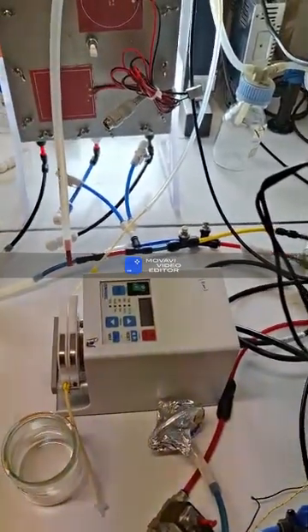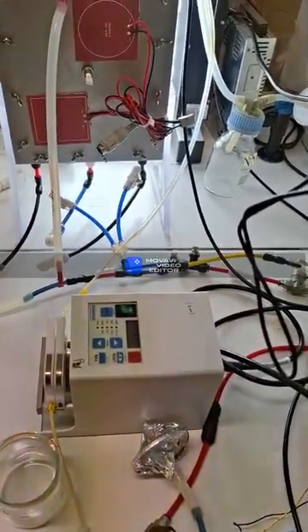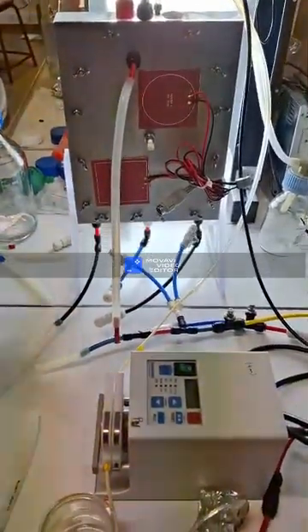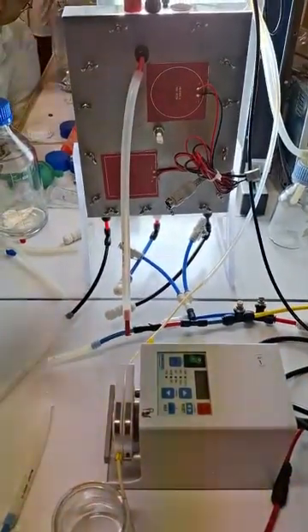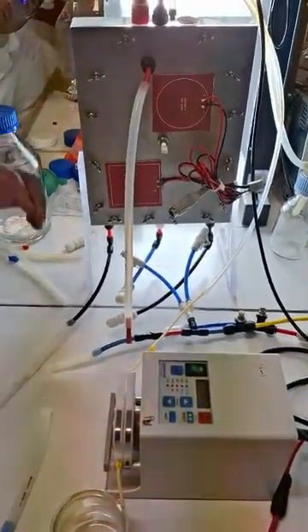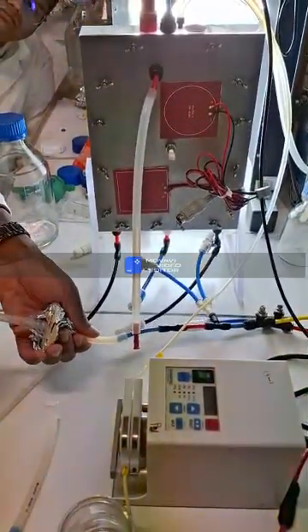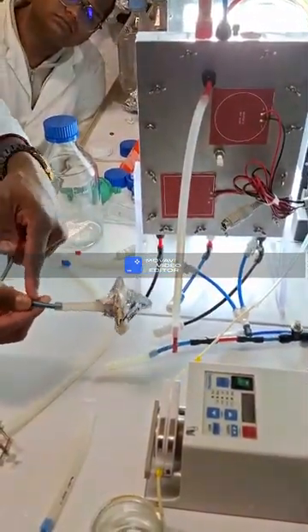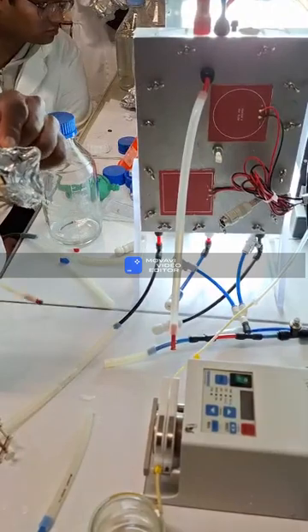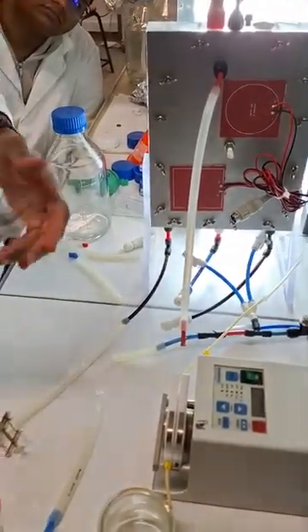Now for this part, we're just going to add air, not carbon dioxide. Yes, normally. But I'm thinking about something: the fact that we will use this vent filter for air, and normally I will plug it here, so maybe it will be more interesting to make the deviation here, to have the filter. Otherwise, I will have to use more filters. Exactly. So I will do that.